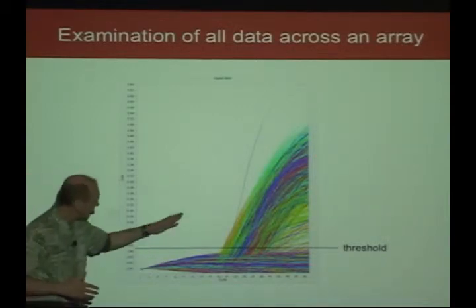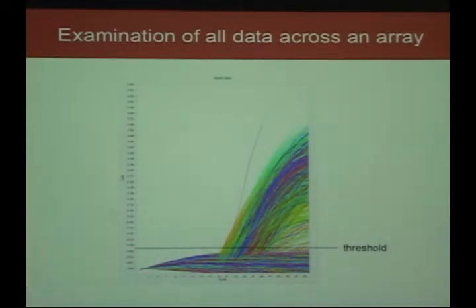If things start to come up after 5 or 9 cycles, they're way too abundant. If they don't come up until 35 or 38 cycles, you didn't have enough to get a good quantitation.